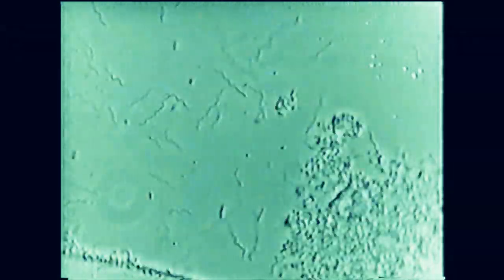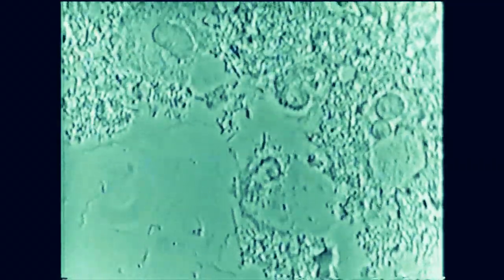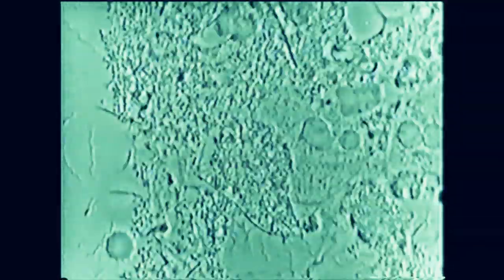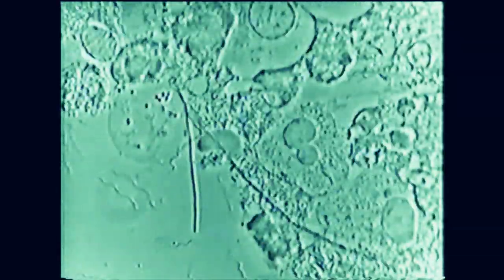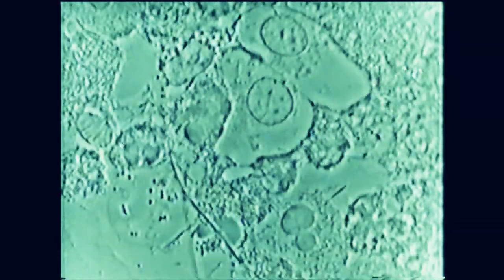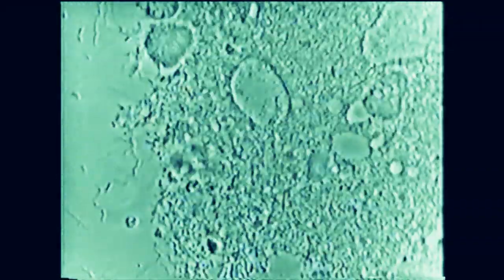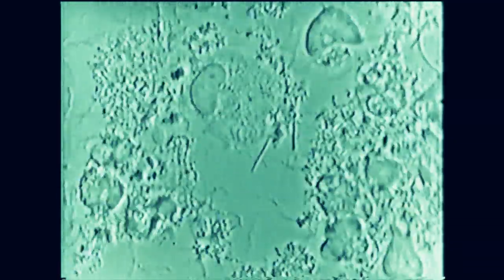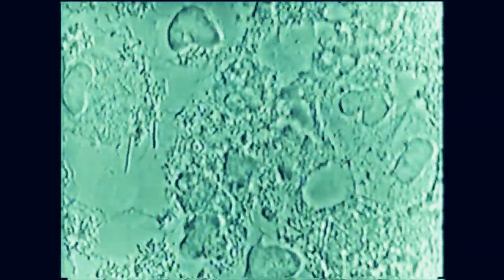Many treponema spirochetes, very active. But I want you to look closely at the white cells which are present in ANUG. Mostly what we can see are the white cells, and what we can see is the presence of those protozoa that are very violent with the three spirochetes.